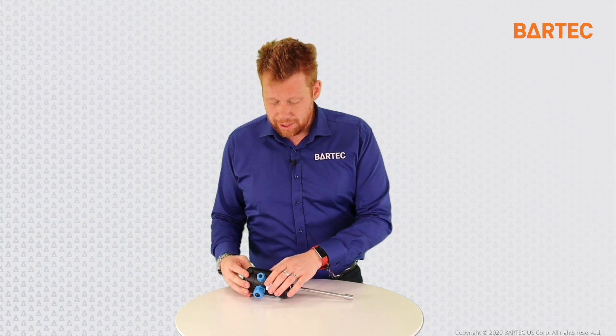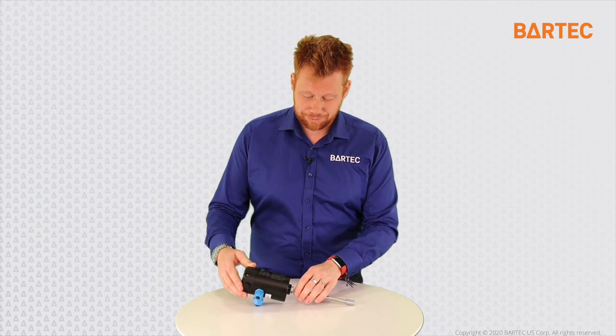We then have a fiber optic. The light source in the evaluation unit sends a light signal through the fiber optic all the way to the probe through this connector. It's actually a multi-component cable because we have some wires also running through the fiber optic cable. Those wires land in the probe and are used to monitor, amongst other things, the temperature probe inside the Hygrophil F Probe.